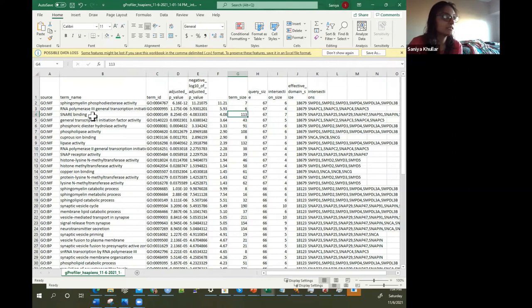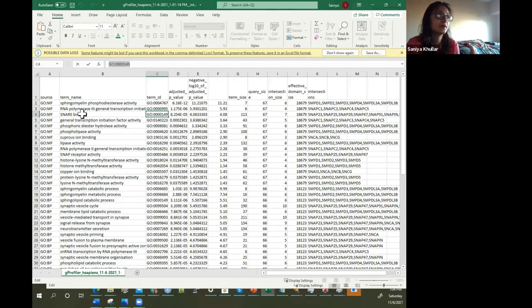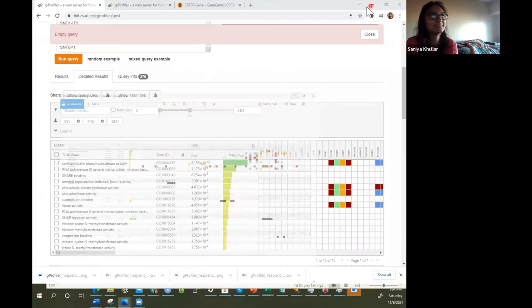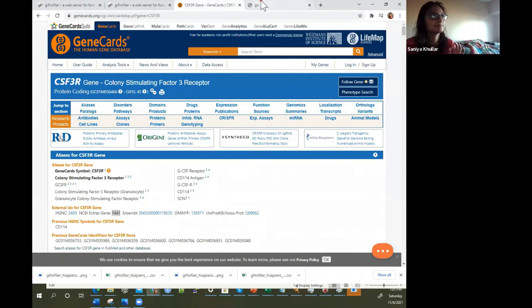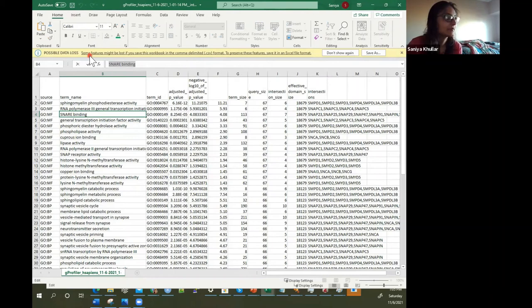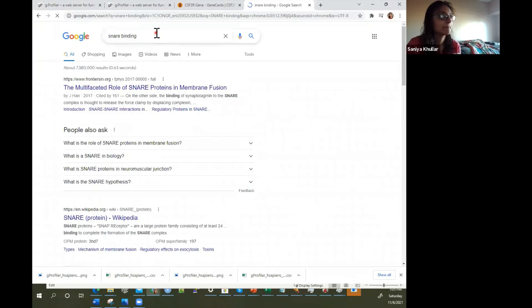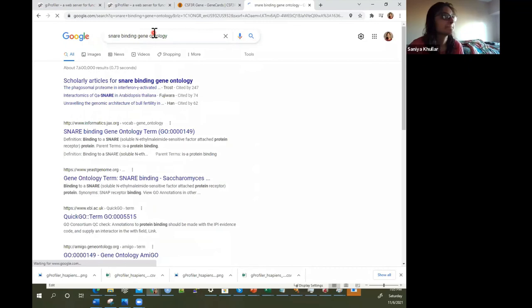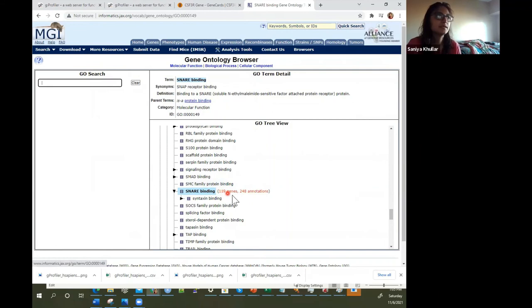Let's check out what SNARE binding is — it has a gene ID. We can search for it and see. It looks like the gene ontology page shows 119 genes and 248 annotations — but that's for the mouse genome. So it's roughly similar, with some differences.